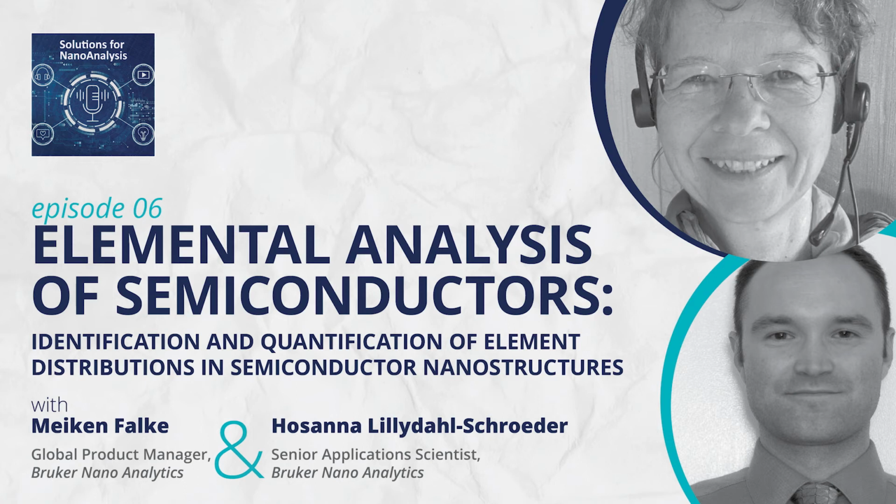And then obviously in terms of life science topics, you're dealing with typically lighter elements rather than the heavier elements that we would be using for semiconductor applications as well. So, based on all that, what are your thoughts on analyzing light elements by EDS? Because we can also obviously get into some deconvolution problems on the low energy side, where you have many lines, say L, M, N lines for heavier elements overlapping with K lines from our lighter elements in those areas.